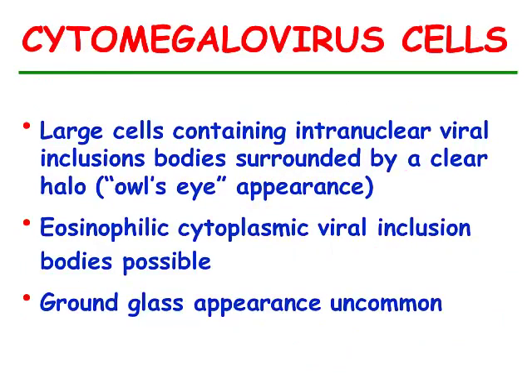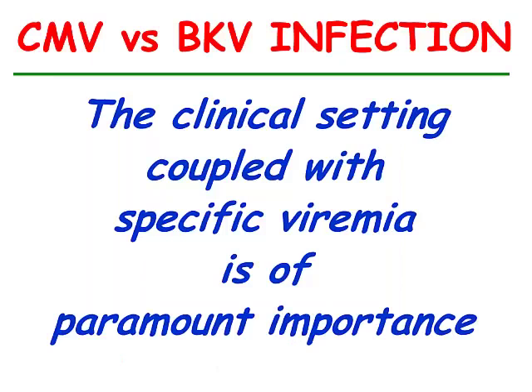So an important thing is that these cells can be similar to the cells you can find in the urine in case of a cytomegalovirus infection. So it's not easy to distinguish the two types of cells on morphological grounds only. One very simple way to distinguish the two situations is: I've seen decoy cells in the urine, so it is most likely that the patient is suffering from reactivation of BK virus, but we cannot exclude CMV reinfection or infection. So the thing to do is to evaluate the clinical setting.